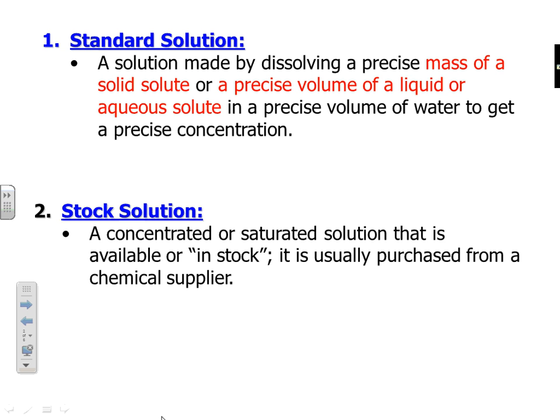And we're going to hopefully make a standard solution. We're going to make it by dissolving a known mass in a very well-known volume. We can make a standard solution as well by diluting an already existing solution, right? So we could take the volume of an already existing solution and add some water to it.